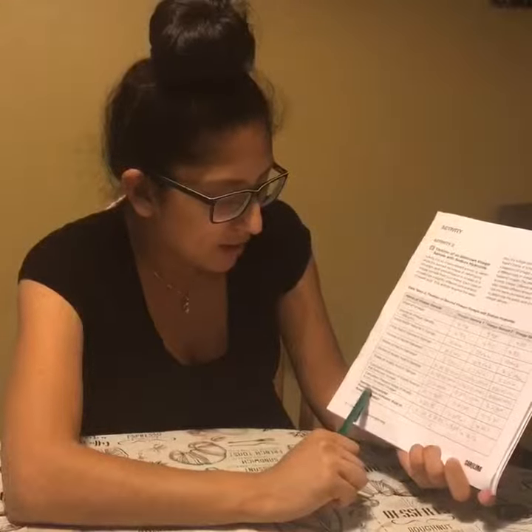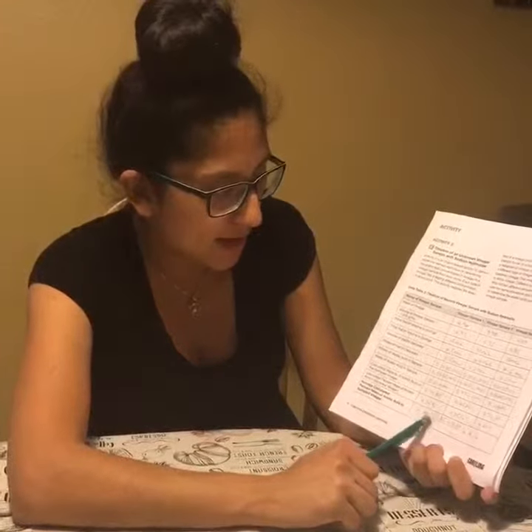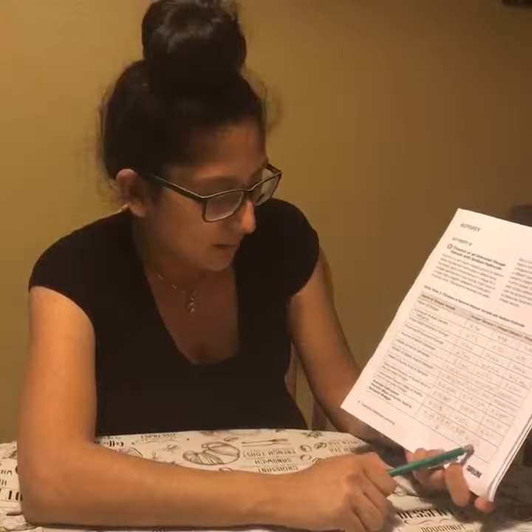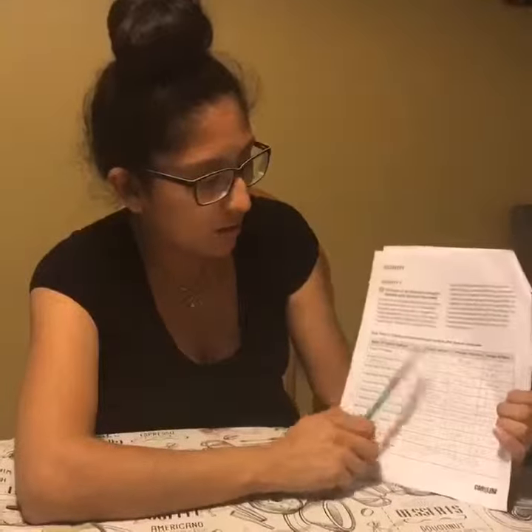The average calculated percent of the mass, like I said, I got it by adding vinegar sample 1, 2, and 3, and then dividing by 3. And then for my percentage, I got 4.12. And I'm guessing it's lower than data table number 1 because the mass of the vinegar was obviously lower than data table number 1.